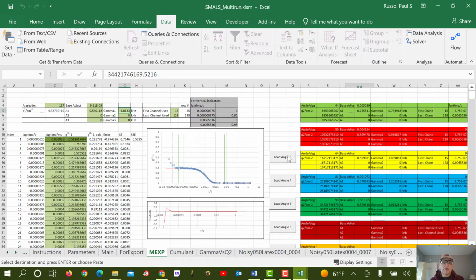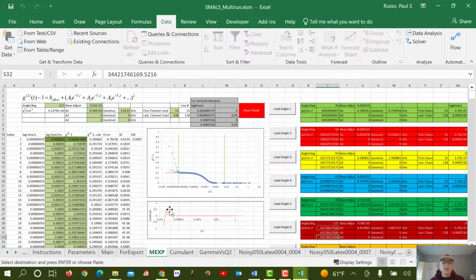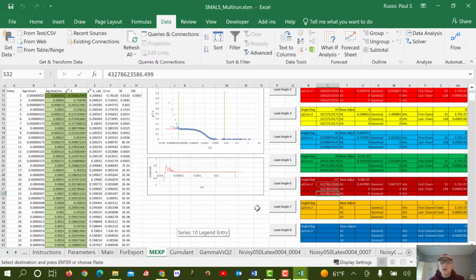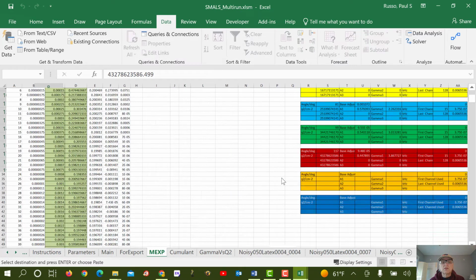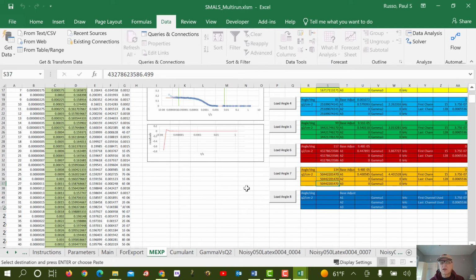This is our bad one, bad channel. Let's see what these residuals look like. A mess, see? But we pretty much got it tamed by the time we're fitting the data. Maybe we could have gone higher. Okay. And 7. And 8.